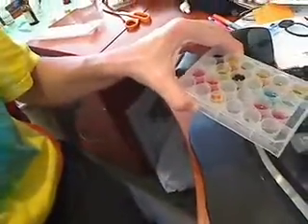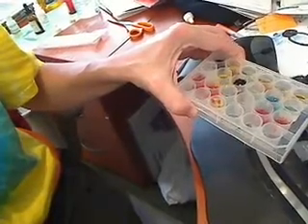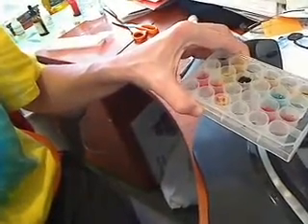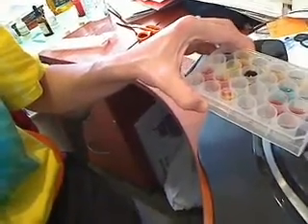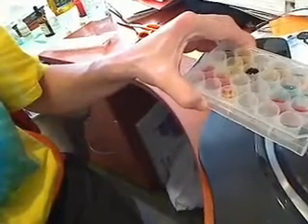So the setup was that in each of 6 wells, you were supposed to put water, albumin, unknown solution, saliva, bread or potato, and a fatty acid or an oil food. So the water, of course, you just use tap water. Albumin came with your kit, as did the unknown solution, the Sudan solution, the iodine, and the copper sulfate. So your indicators are the Sudan, the copper sulfate, and the iodine. Those are your 3 indicators.